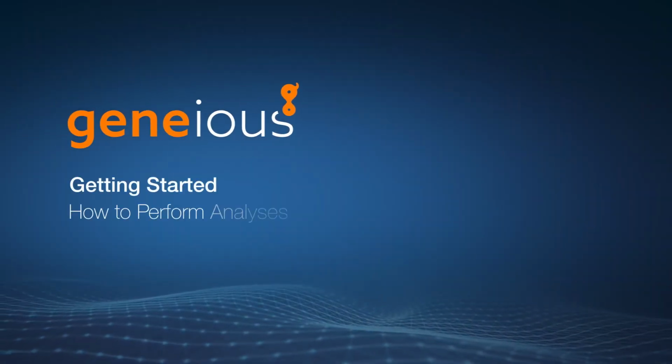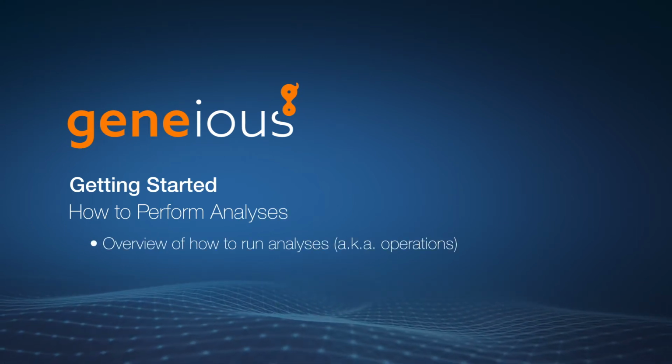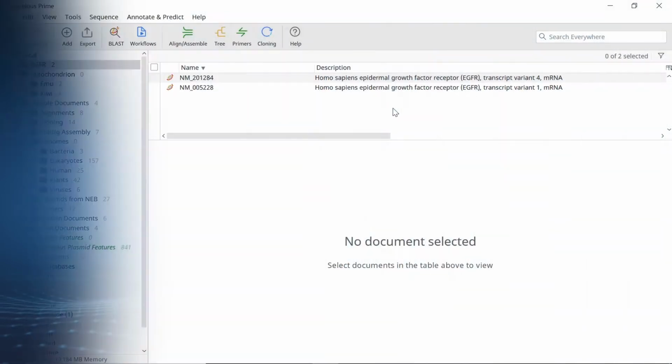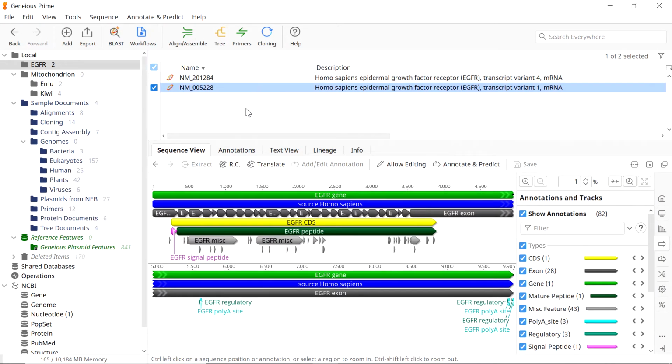Getting Started tutorial, I'm going to give you an overview of how to run analyses, also known as operations, in Geneious Prime. Within Geneious, analyses are generally performed by first selecting your files of interest and then selecting a desired analysis from the toolbar at the top. The toolbar contains shortcuts to common analyses, such as BLAST, workflows, aligning and assembling, tree building, primer design, and cloning.